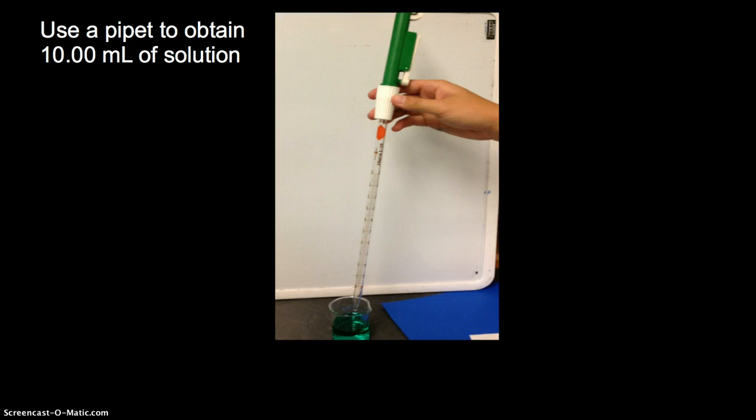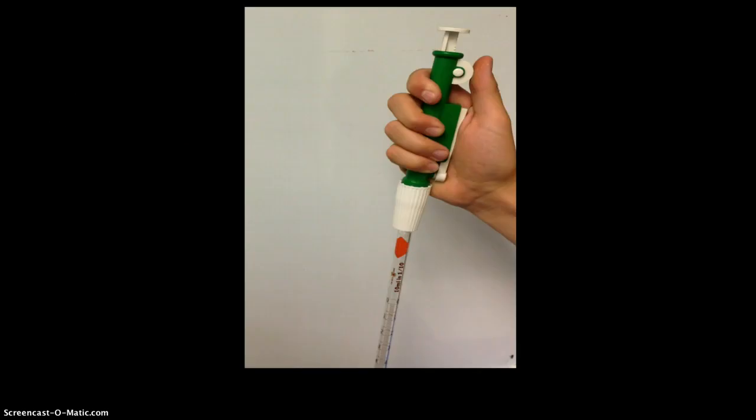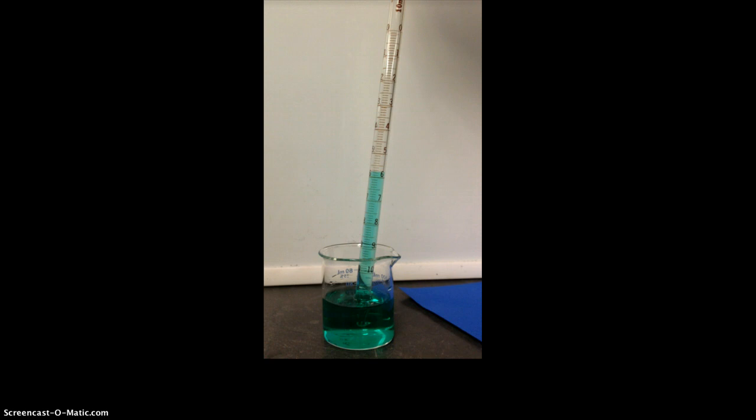A pipette is a very different piece of glassware compared to anything you've used before. The 0 marking is at the top of the device. When using the pipette, you use a pipette filler, which goes on the end of the pipette like so. Use your thumb to draw liquid up the length of the pipette. As the liquid fills up the pipette, draw it up to the 0 marking on the pipette.